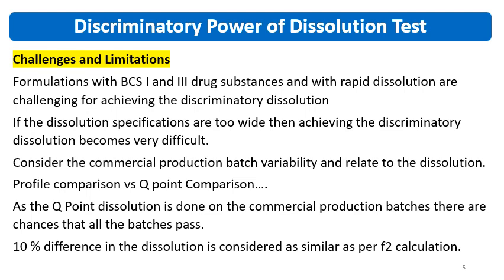If the dissolution specifications are too wide, then achieving discriminatory dissolution becomes very difficult. So for case 1, the formulations containing BCS class 1 and 3 drugs and immediate release formulations, you have to show your efforts for getting the discriminatory dissolution.